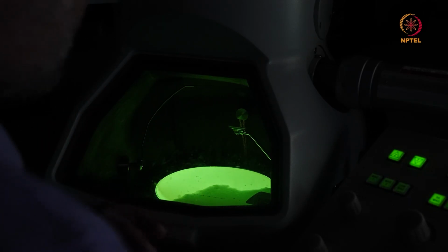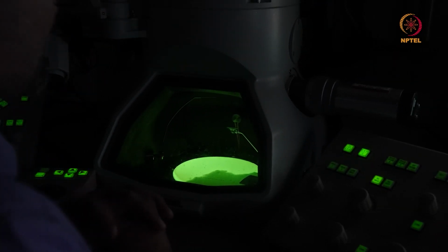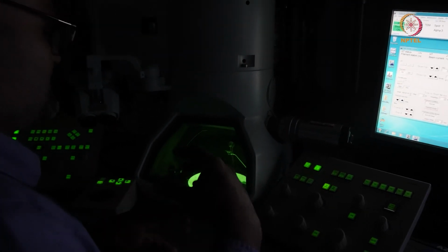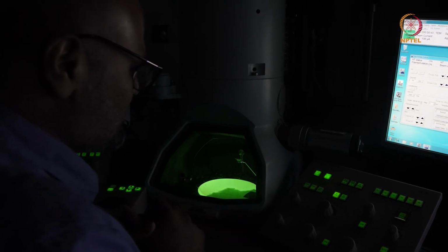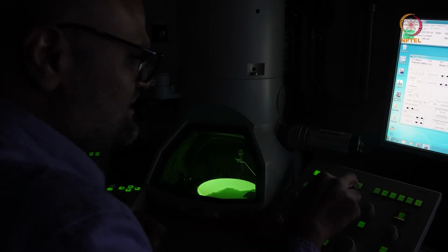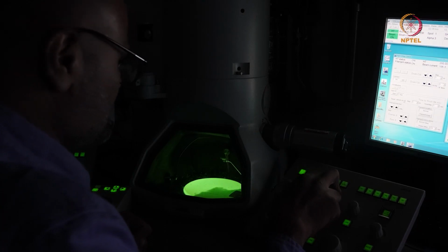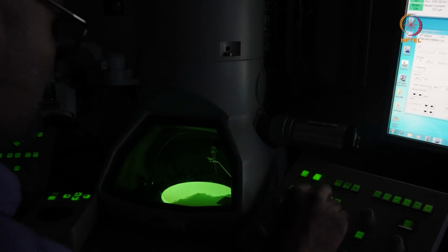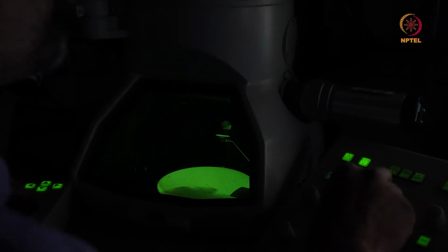Now, if I use the same operation on a Thermo Fisher microscope, correcting the eucentric height, there is something called the alpha wobbler. What it does is it tilts the specimen holder with an amplitude of 5 degrees or 10 degrees or so, and you see that this thing changes. But in the JEOL instrument, you either click on image wobble X or image wobble Y. One important step is you go to a magnification of somewhere between 25,000x to 40,000x.